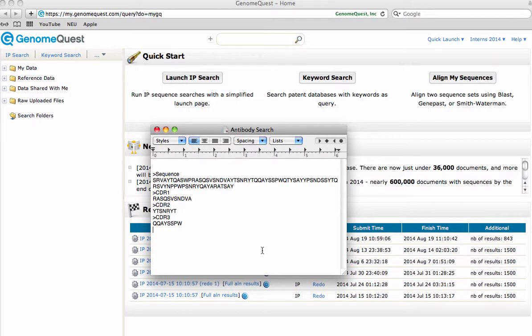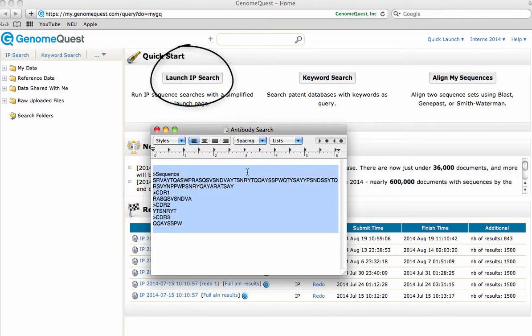When searching an antibody sequence with three fragments, input your query sequences in a single search using the FASTA format. The full sequence, followed by each of the complementarity determining regions, or CDRs. Copy and paste these sequences in the IP search box.